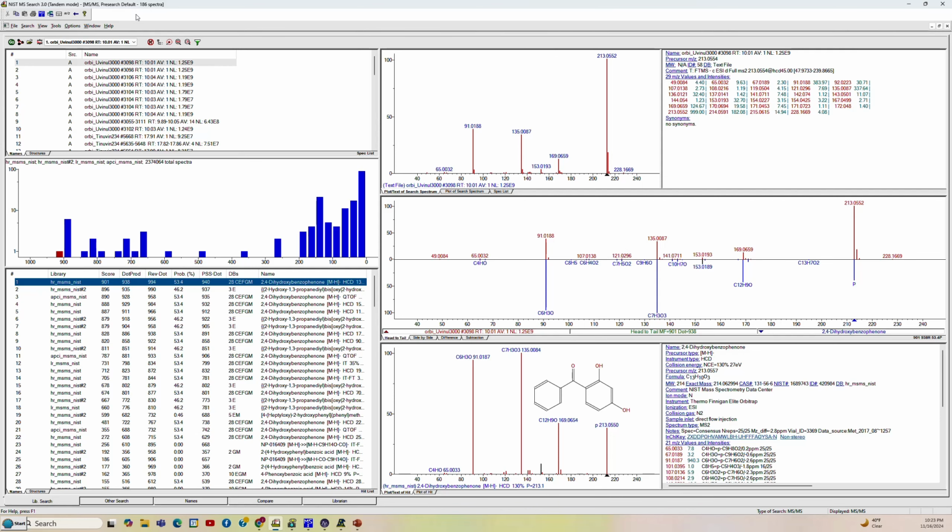We'll discuss the actual search results you get and the different types of searches in a different video. But I hope this will be helpful in getting the things set correctly. If you don't get them set correctly initially, you cannot get good results. So take a look at the video, take a look at the handout that goes along with it, and I think you'll be a long way down the road in getting the settings set up correctly and understanding how the search works.